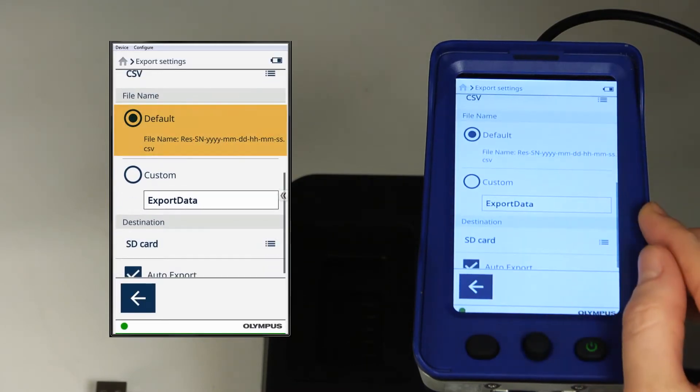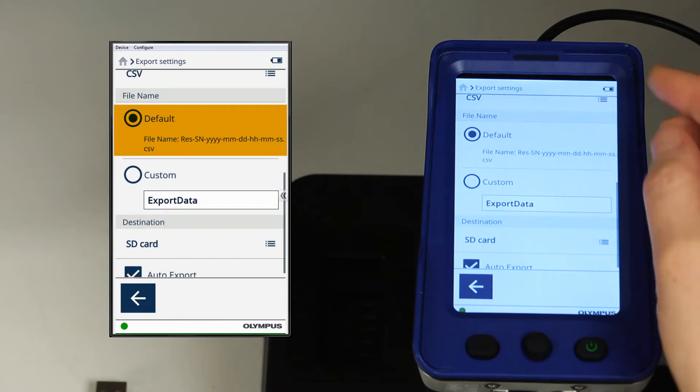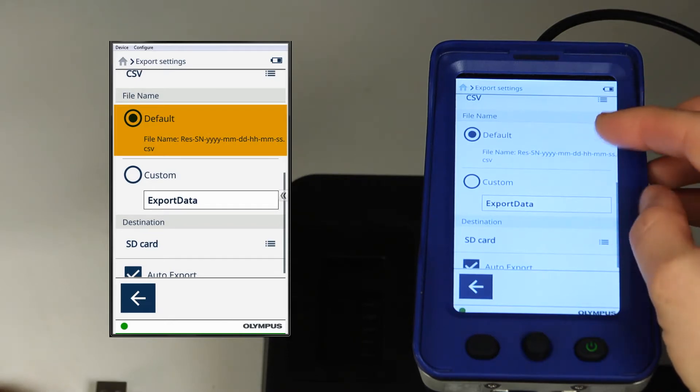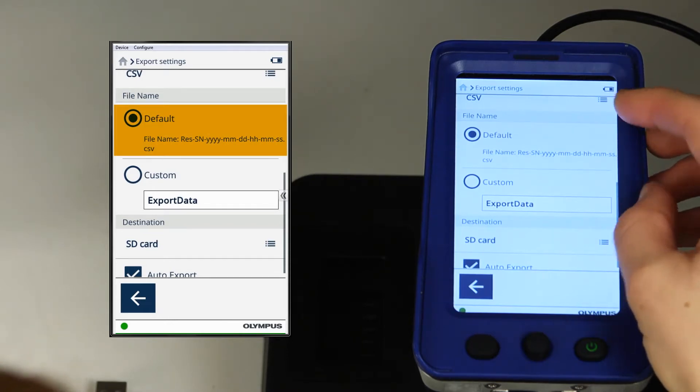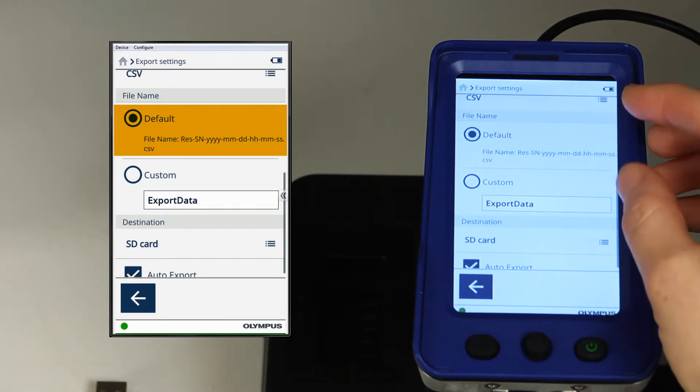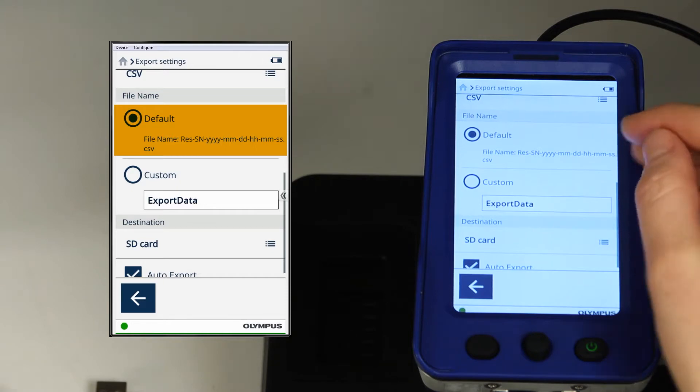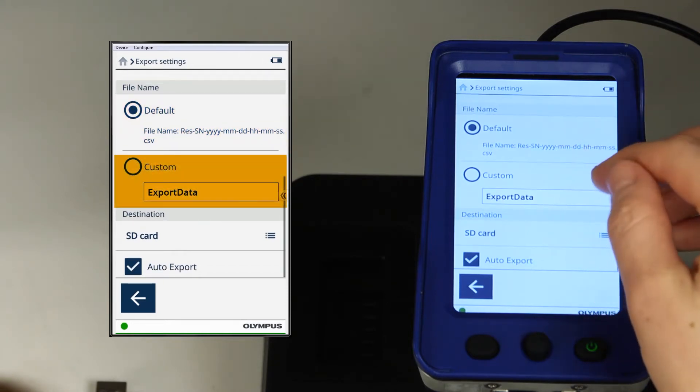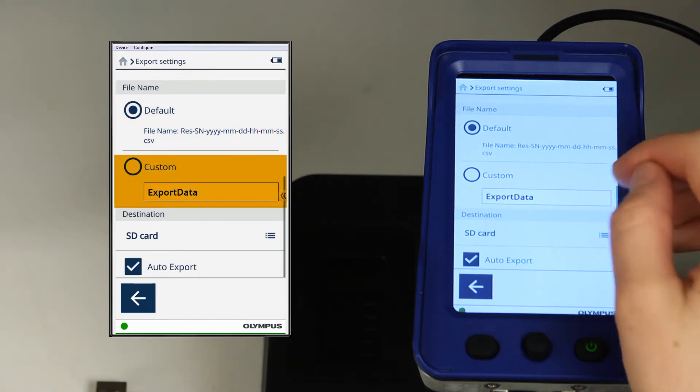For the file name, you can leave either the default name, which is the serial number and the date of analysis, or you can give the file your own custom name.